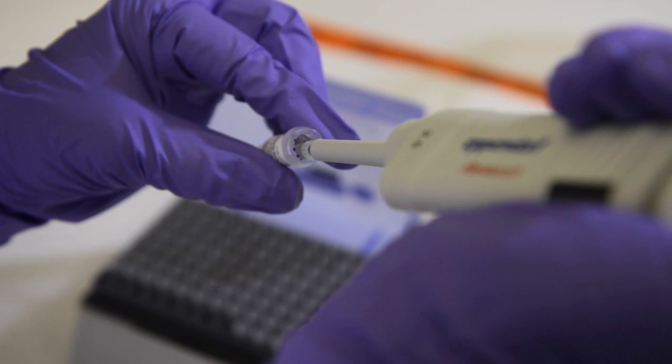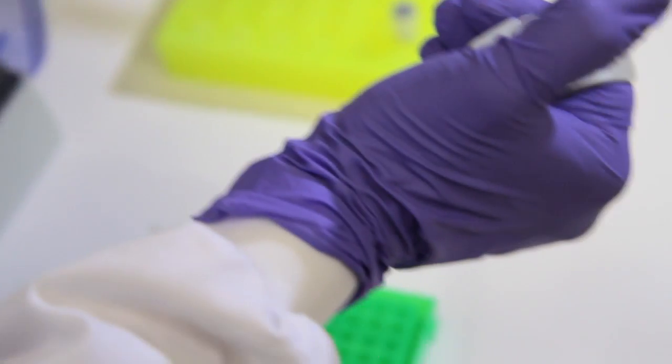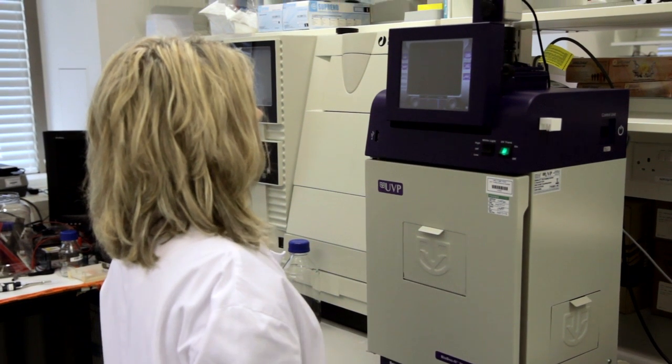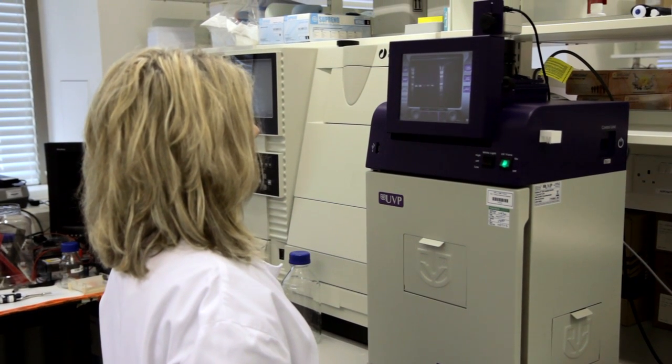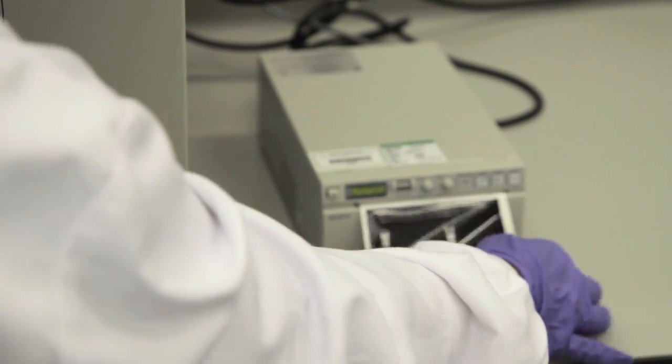Add the required amount of loading dye to your PCR tube, 1 microliter for 5 microliters of PCR reaction or 5 microliters for 50 microliters PCR reaction depending on the concentration of the PCR. You cannot always judge this perfectly in the first instance and may need to run another gel with an adjusted amount if you want a really good picture.